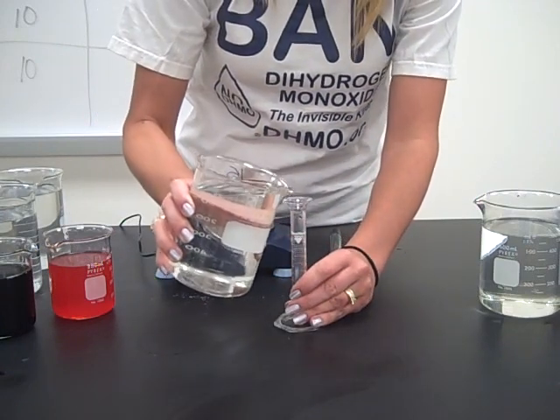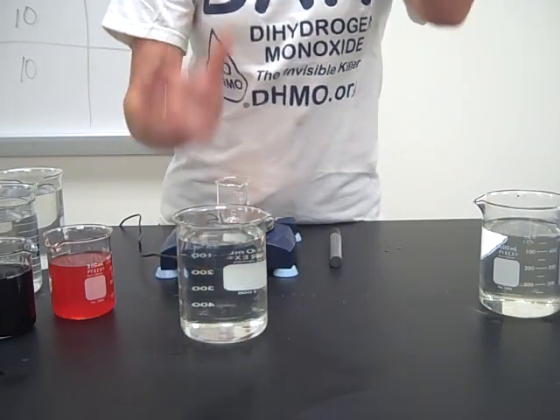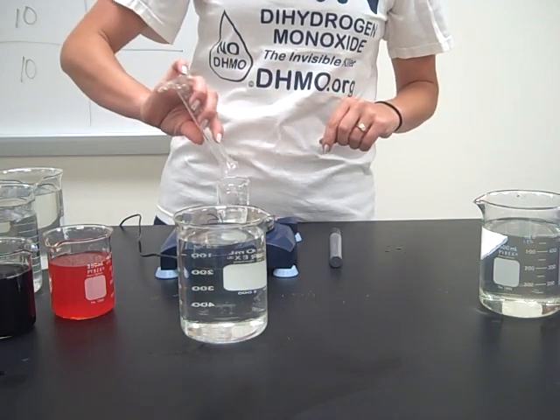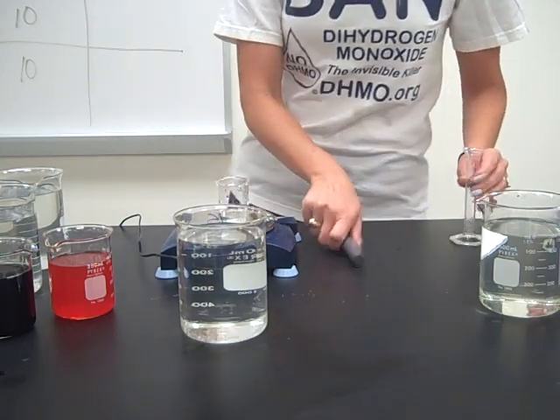So 10 milliliters again. I'm going to check this one a little more closely. Zero it out. Ten point seven three.